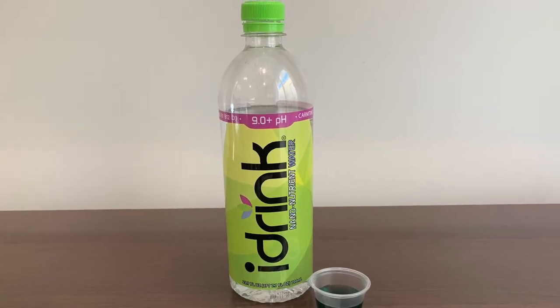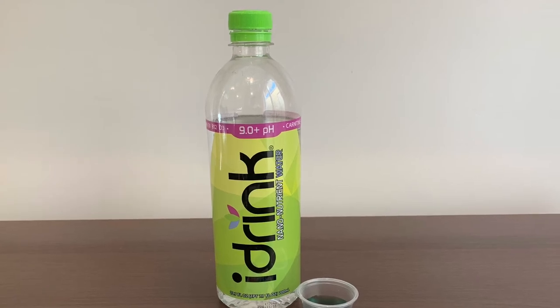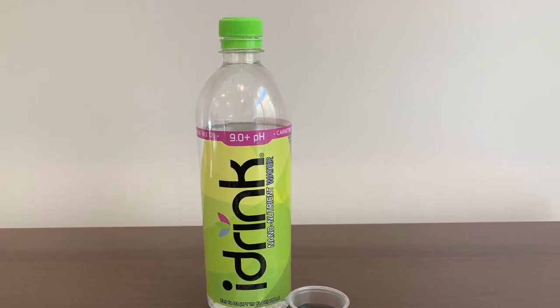So let's test the pH level. This is the actual test. This is — oh, Jesus Christ.